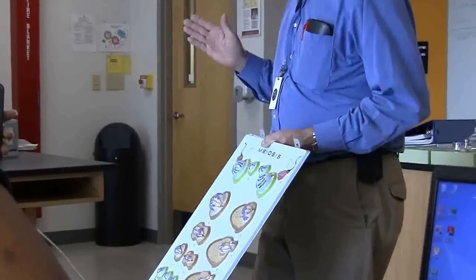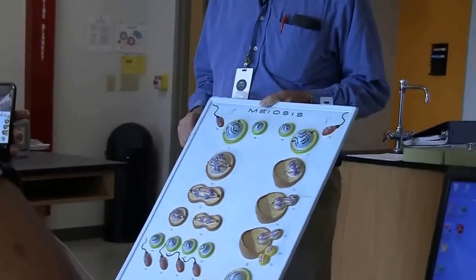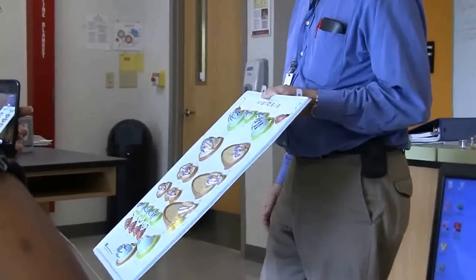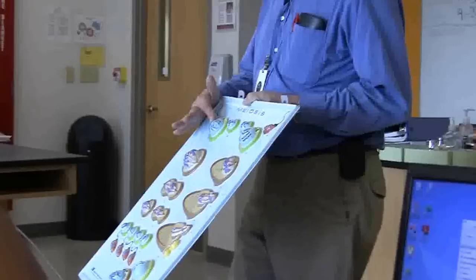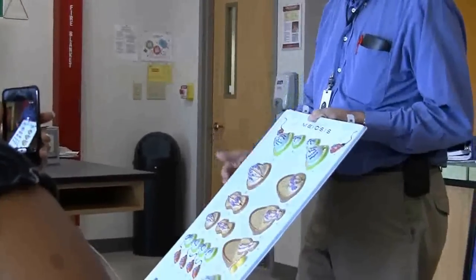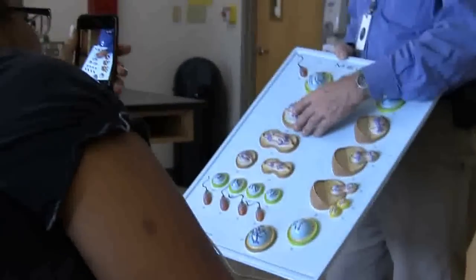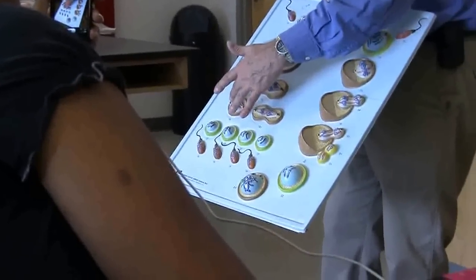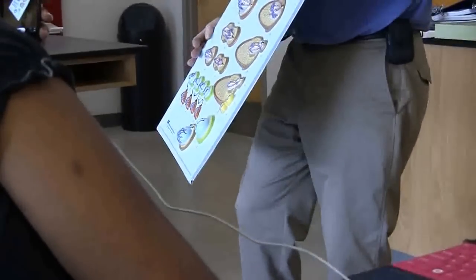It undergoes mitosis. Here's another stem cell and the primary spermatocyte. All these cells up to here are diploid because they've been produced by mitosis, which maintains the chromosome number. A diploid cell dividing by mitosis gives diploid daughter cells. The primary spermatocyte then undergoes meiosis 1 and produces two daughter cells, here and here. This one's already in anaphase of meiosis 2.